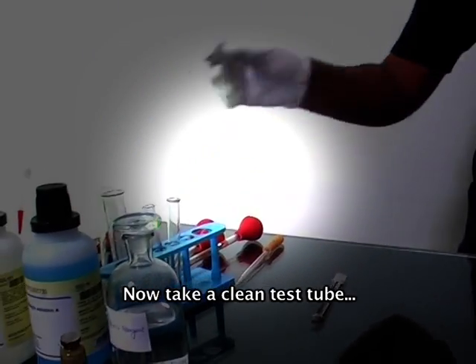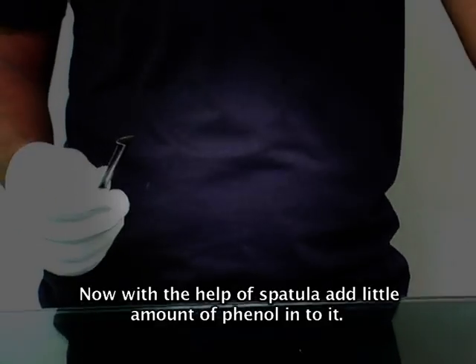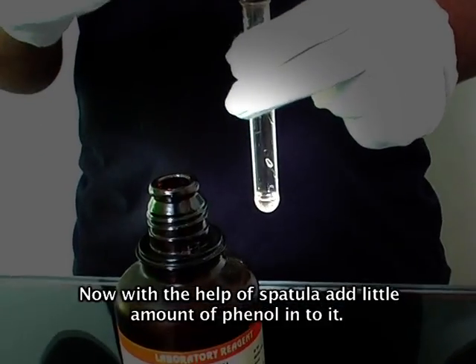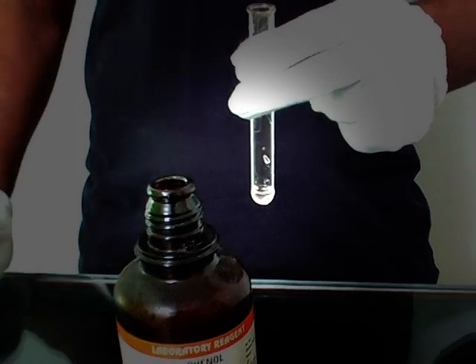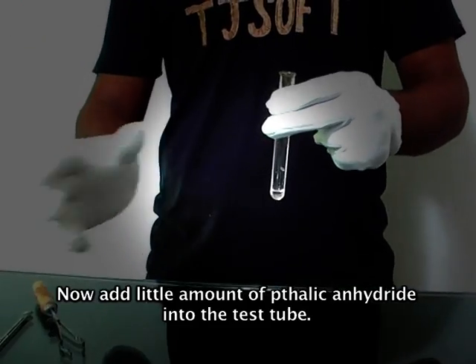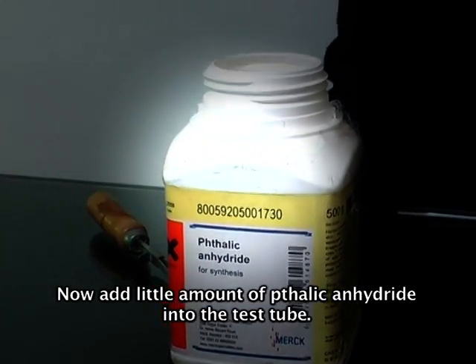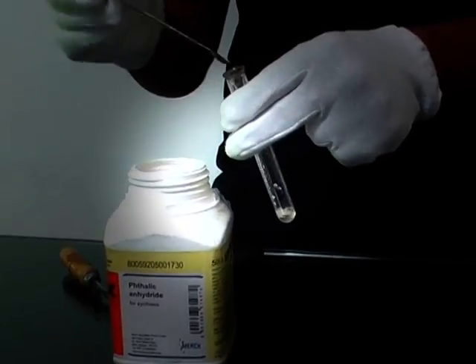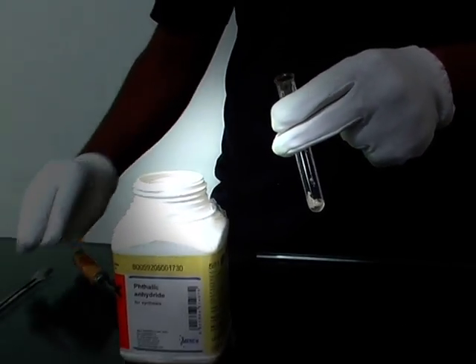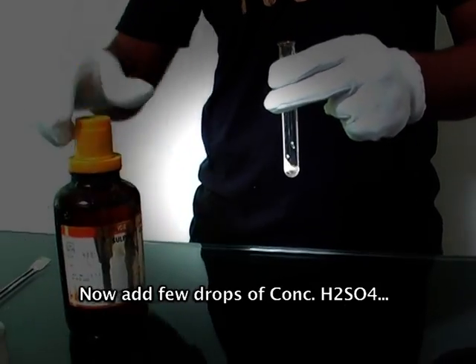Now take a clean test tube. With the help of a spatula, add a little amount of phenol into it. Now add a little amount of phthalic anhydride into the test tube. Now add a few drops of concentrated H₂SO₄.